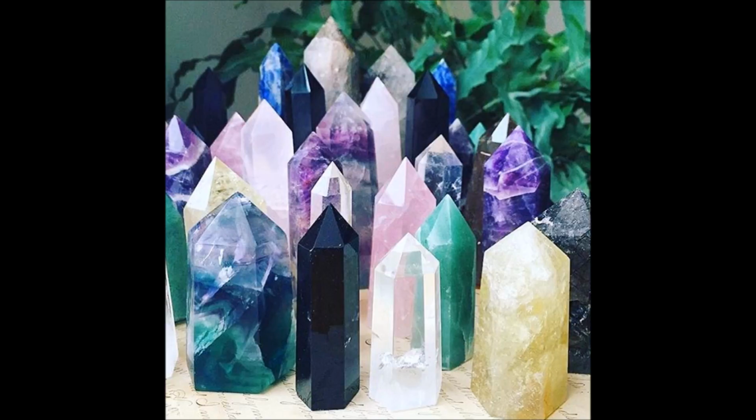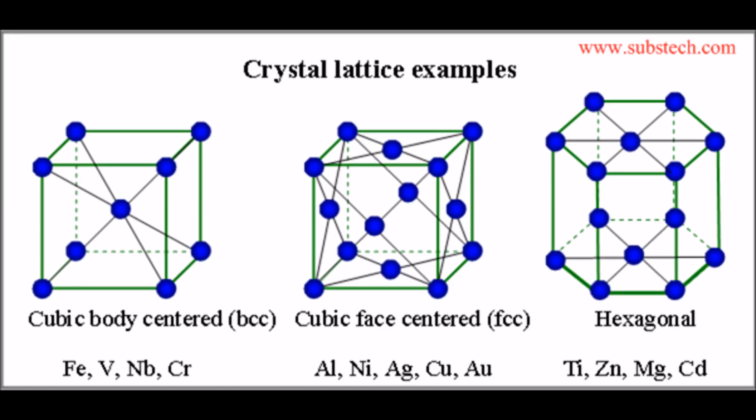Crystals form pretty, geometric shapes because of the internal arrangement of their molecules. A crystal is organized with different layers of atoms, each of which lay, one on top of the other, in a structured, organized arrangement. D-spacing is a phenomenon which refers to the distance between each layer of these molecules. The distance between layers of the crystals varies between different lattices.